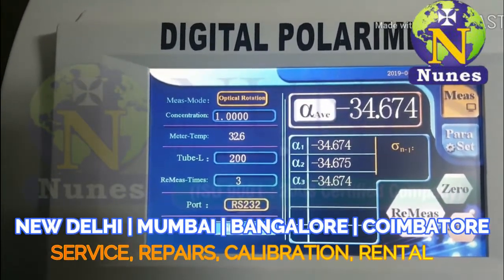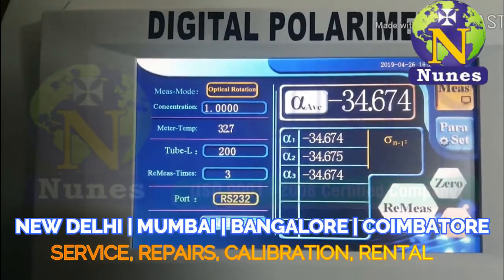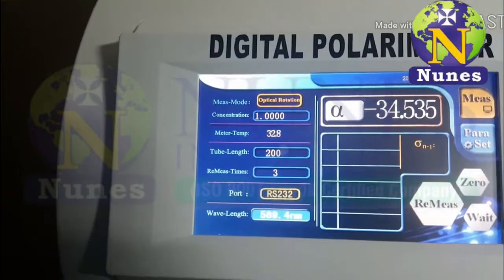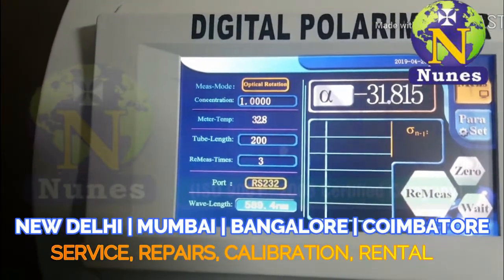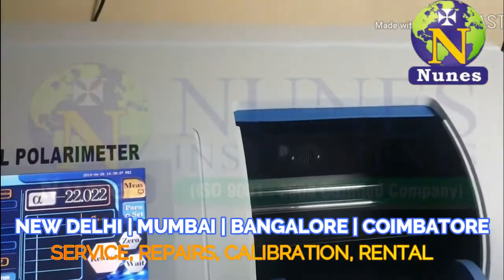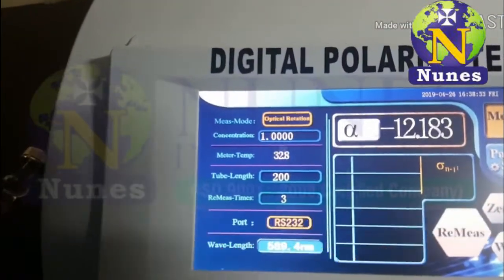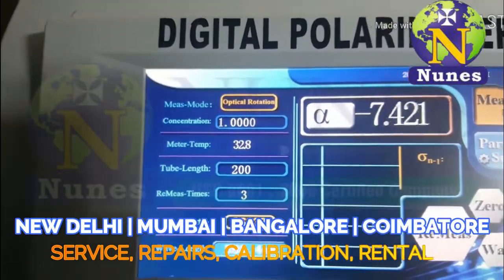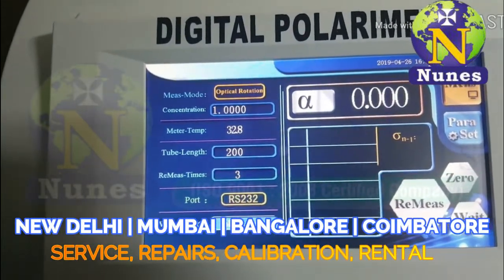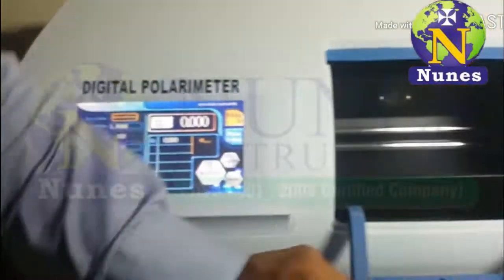This is the final reading: minus thirty-four point six seven four. Now remove the sample. The display is automatically showing zero. Now the reading decreases back to zero point zero zero zero zero in the empty chamber.